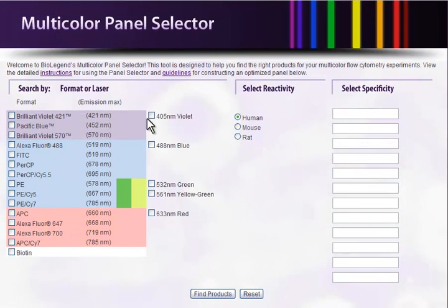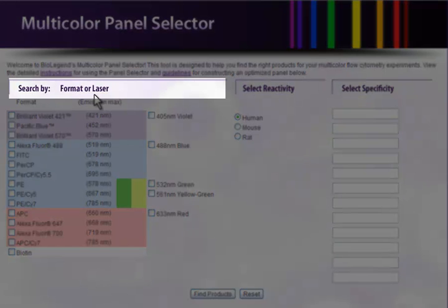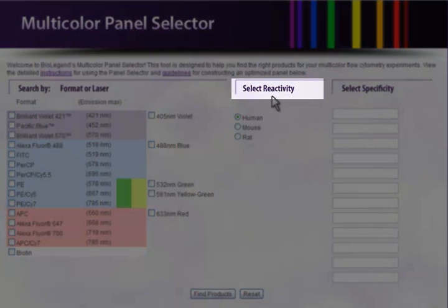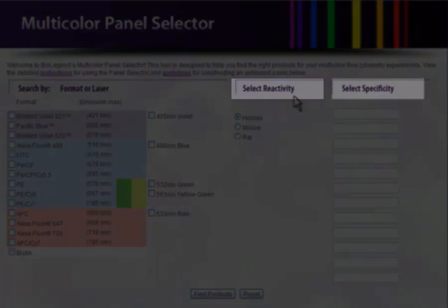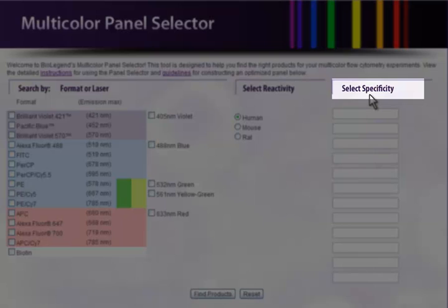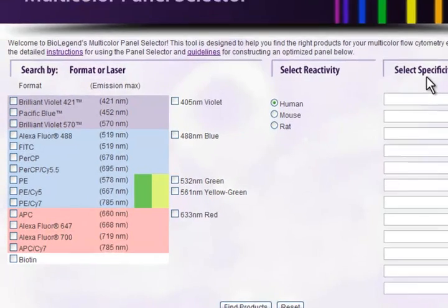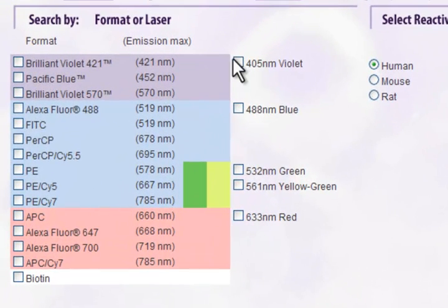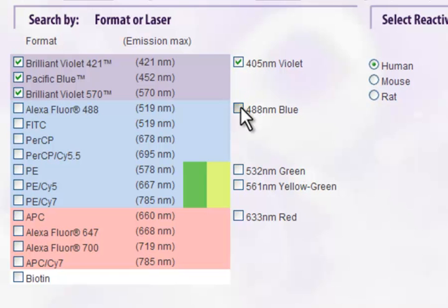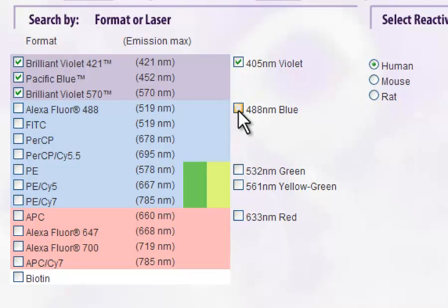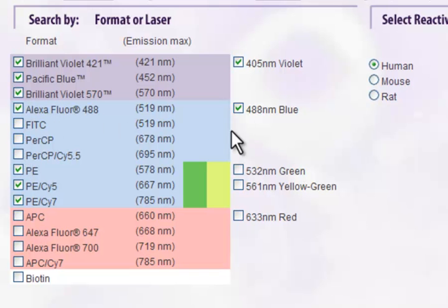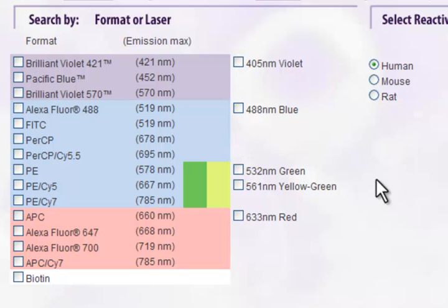The selector has three categories for input: Format or laser, reactivity, and specificity. You can turn on and off lasers based on the specifications of your instrument. Or if you don't want to use a certain fluorophore, you can individually turn on or off any formats. If you leave all the entries blank, the selector will default to giving you results for all of the formats.